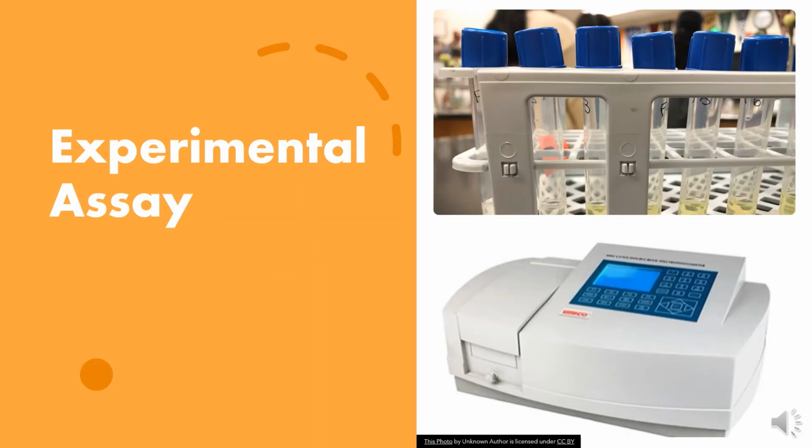Wan and Huber performed an assay similar to the one I described in my previous video. In their assay, they used the ONPG analog as the substrate instead of lactose, because lactase splits it in the same way it does lactose. The difference with ONPG, though, is when it is hydrolyzed, the ONP product that is formed produces a yellow color.